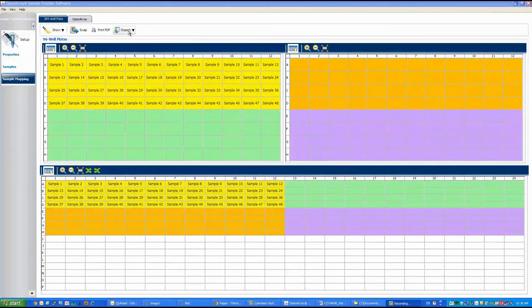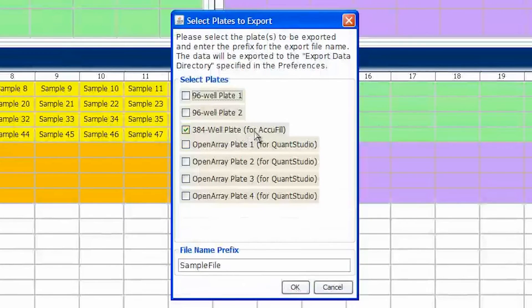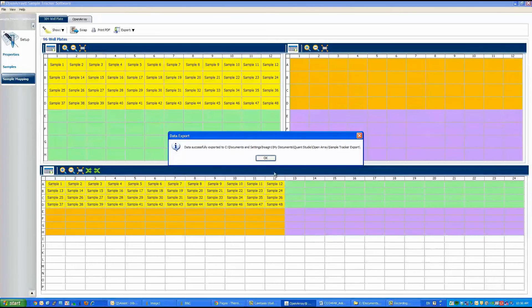One last step and you're almost home free. All you need to do is export your file and all your sample information is ready to go. Once you have created your exported sample file, you can incorporate it into your experimental run in a few ways. Number one, you can combine it with the SPF or TPF file during the sample loading process on the AccuFill. Or two, you can import your sample information once your run has completed. Either way, Life Technologies software allows great flexibility in case you realized you input something incorrectly or forgot to add your sample information altogether. Just know you can change or add things at any time before or after your run.